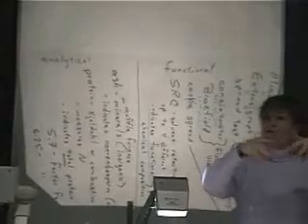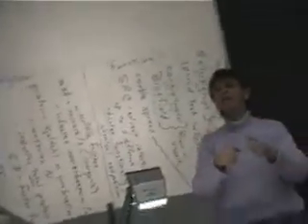Functional tests, or really rheological. Is that what rheological means? Rheology is the study of stress and strain. How does a substance react when you put pressure on it? How does that dough feel? How does the batter flow? That's really what rheology is. So all of these things are trying to measure how that flour is behaving when you get it into a system. Would the texture analyzer be rheological? The texture analyzer would be finished product, rheological, yeah, because you're looking at finished product.